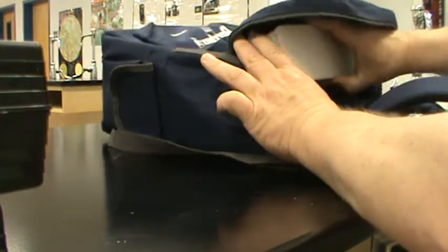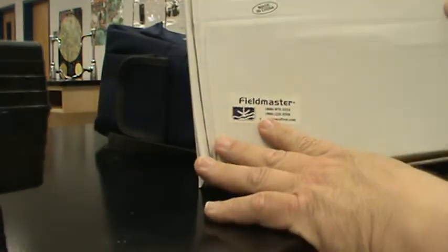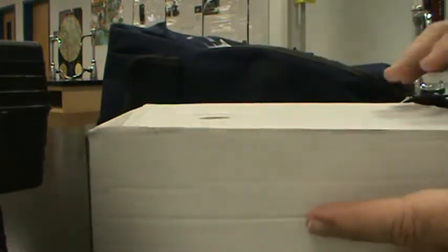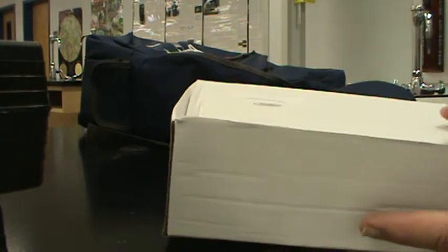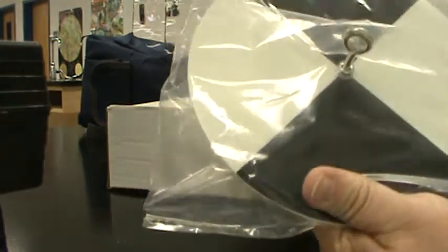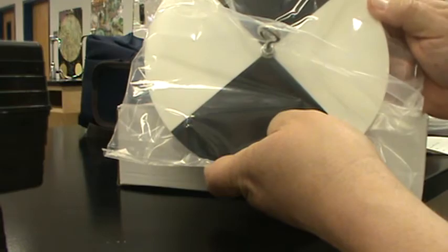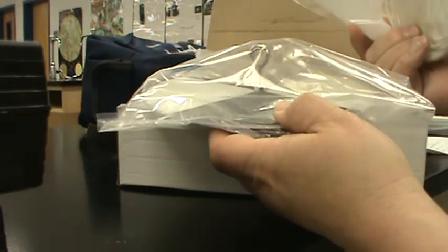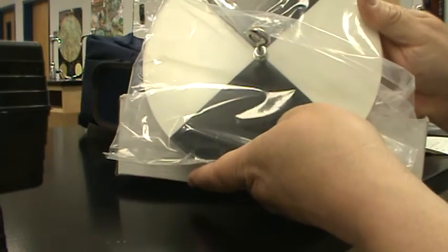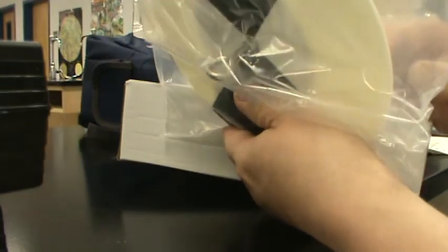The final tool in here is called a Secchi disc. Now, I'll open it up and show you what this disc is for. We've not used this, but what this disc is for is you lower this disc into the water and you keep track of how deep you're going. You have a piece of rope here. You keep track of how deep this is. The deeper that you can go into the water and still see this disc, of course, the better the water quality.